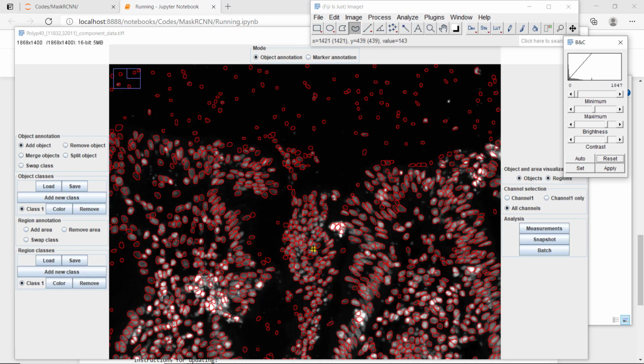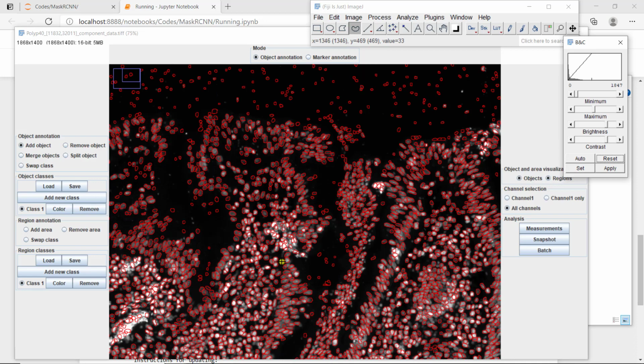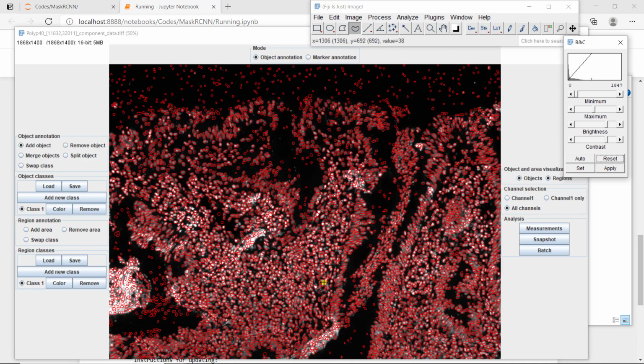Something interesting is that when you look at the morphology, they really look real. MaskRCNN really does a better job than UNet about that, even though UNet already takes into account the morphology. But here, as we directly try to identify individual nuclei, it looks pretty good. When you look at your result, it seems you make some errors, but most of the time the nuclei that you identify are correct, except the ones you hallucinate. But you're just missing quite some. So that's what we have for 256.